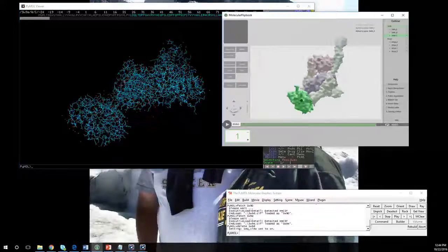On this molecule there is the GD down here. If you look at it, you can see that it's labeled, and I'll do this very commonly, as chain C, so the model is 3W9EC. Over here it's 3W9EB. That's the light chain of E317, so that's chain B. And right over here is E317 heavy chain, and that's chain A in this program. So there's 3 chains in this program.